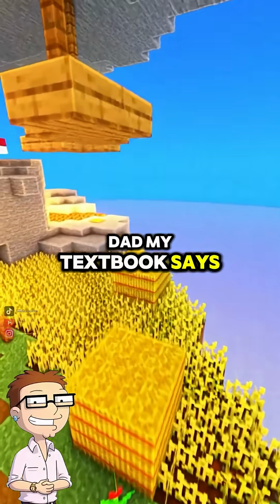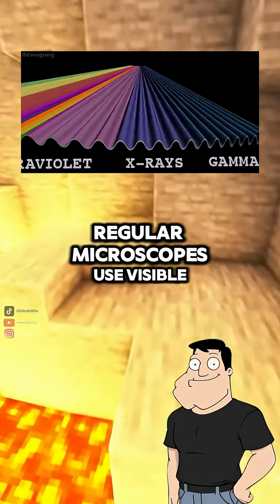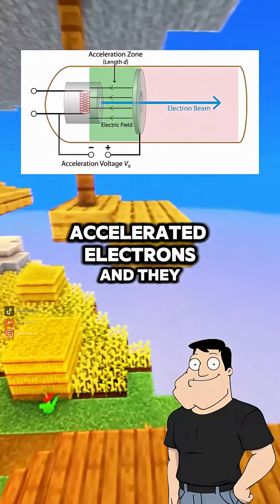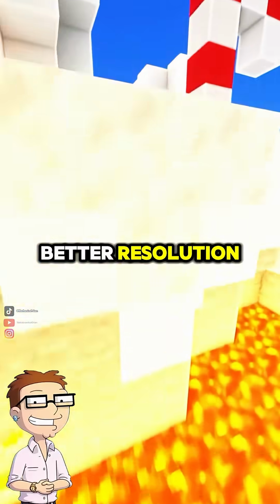Dad, my textbook says electron microscopes can see atoms. How's that even possible? It all comes down to wavelength, Steve. Regular microscopes use visible light, which is too big to resolve atoms. But electron microscopes use accelerated electrons, and they have wavelengths thousands of times smaller. So smaller wavelength means better resolution?